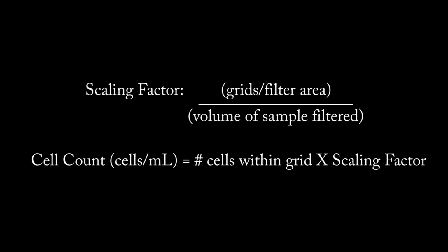DAPI staining has given us a better understanding of what may be influencing the growth of bacteria in household pipes. DAPI staining is just one step along the way on our march to better understanding why opportunistic pathogens grow in household pipes. I've enjoyed my time so far and look forward to continuing my work on this project in the future. I also look forward to applying the knowledge and experience I've gained from working with Nadine and Professor Raskin when working on any new projects in the future.